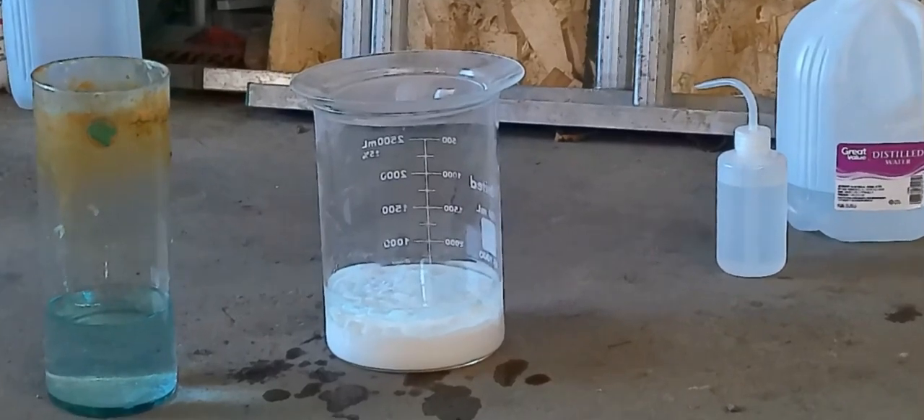As you can see, the waste solution is getting less and less blue, which means our wastewater has less and less contaminant in it from the distilled water rinses. So we're getting closer and closer to pure silver chloride, and it's also very white — the silver chloride. So that's what we want.